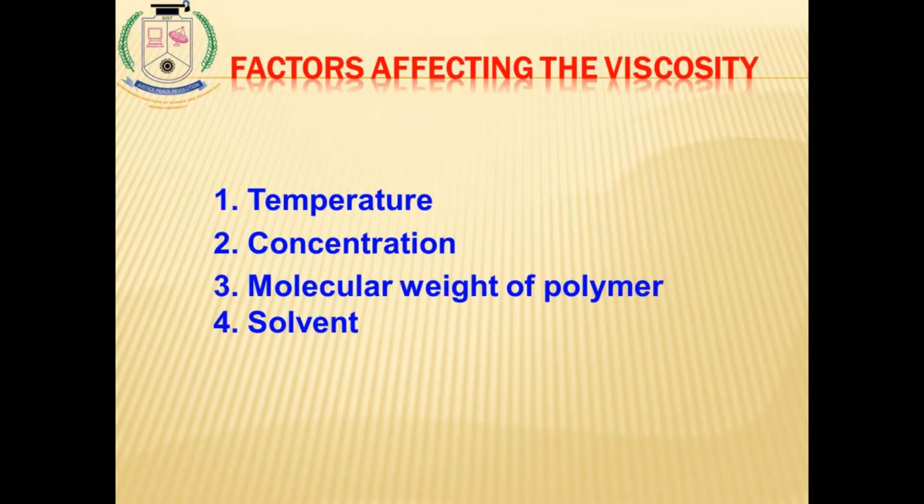Factors affecting the viscosity: one is temperature. If you vary the temperature throughout the experiment, the result may not be reliable, so we have to maintain a constant temperature.